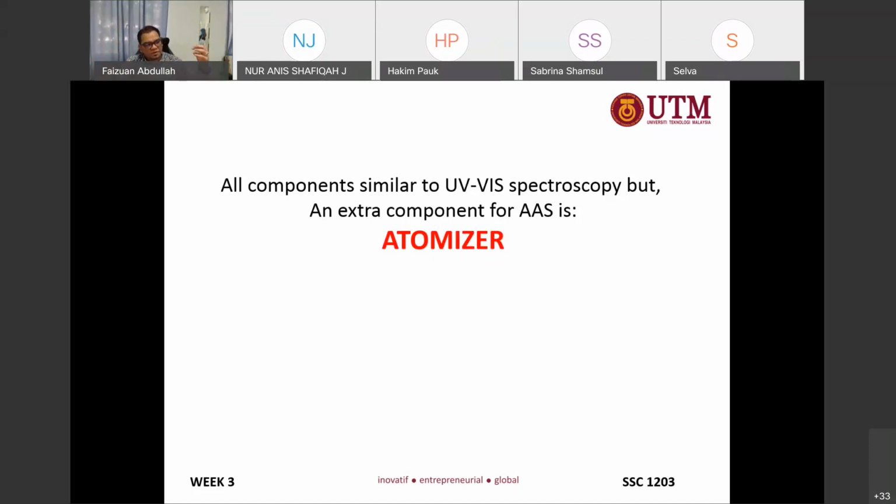We have a light source specific for every type of element. If we put the lead lamp, it provides a spectrum of wavelength that is only absorbed by lead. If we have iron in the sample but without lead, the detector will detect no absorption of the light, because every element absorbs a certain amount of energy.